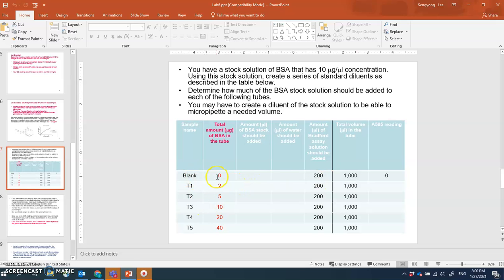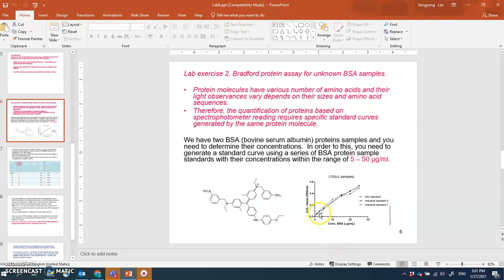The blank will be used to calibrate the spectrophotometer, meaning the absorbance will be zero because there's no protein there. So you'll calibrate using blank to set the baseline, and then measure the absorbance of these samples. Hopefully it will be linear from zero up - as there's more BSA concentration going up in your sample, the absorbance will go up as well.